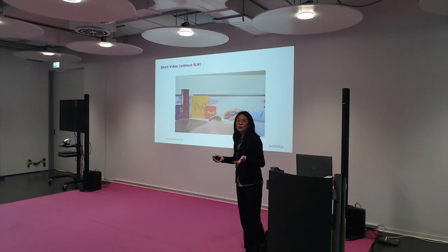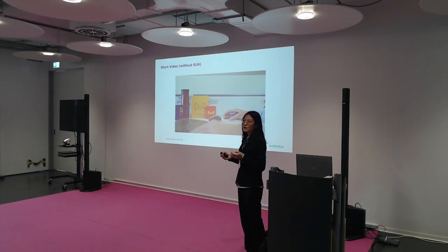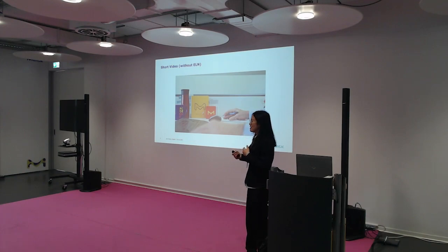Before we take a closer look at how the electronic lab notebook addresses these challenges, let's watch a short video that demonstrates the manual notebook recording process. And I think most of you, or all of you, are familiar with the contents and the steps. This video will demonstrate a real-life scenario of how a lab scientist manages the experiment and the data recording in the paper notebook.